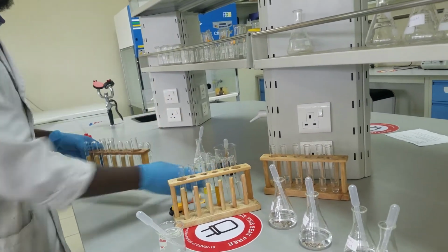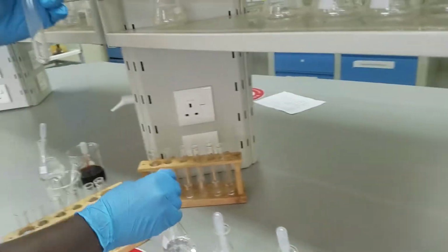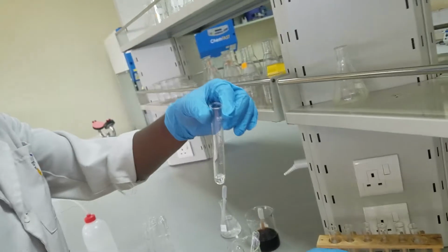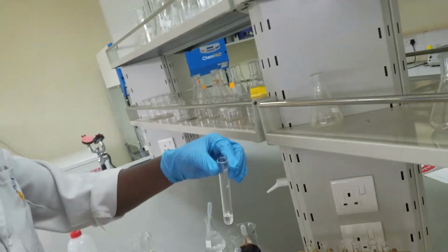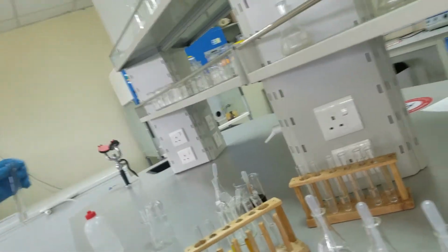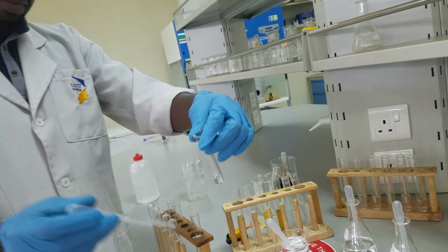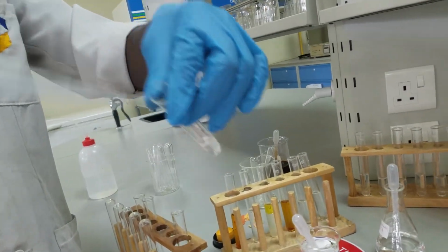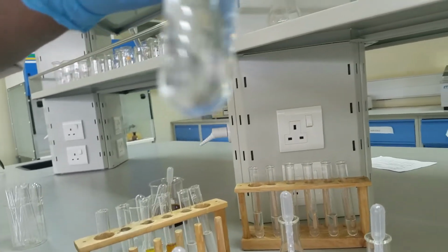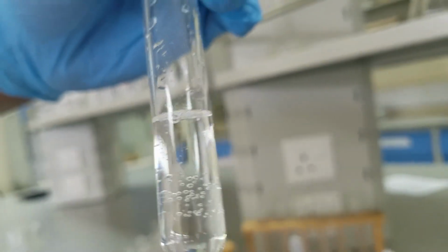So I'll start with formaldehyde. Add a few drops like that, and then 5% of our sodium bicarbonate. See if there is any observable changes. That is formaldehyde. Okay.